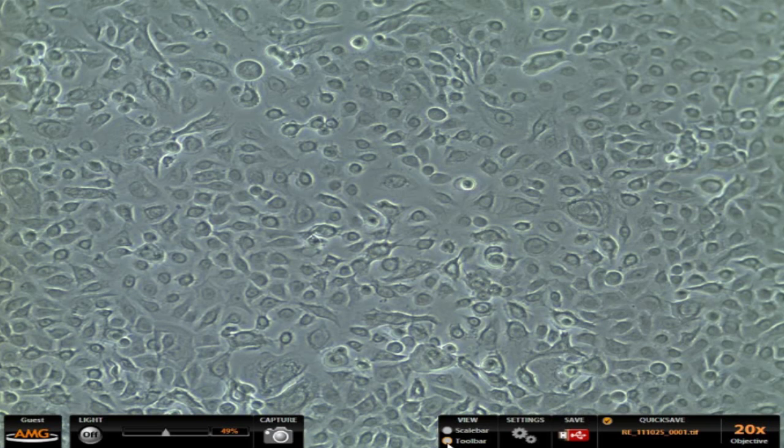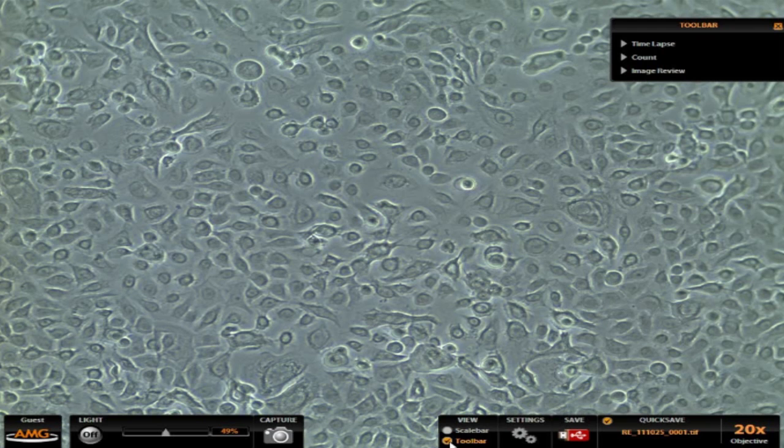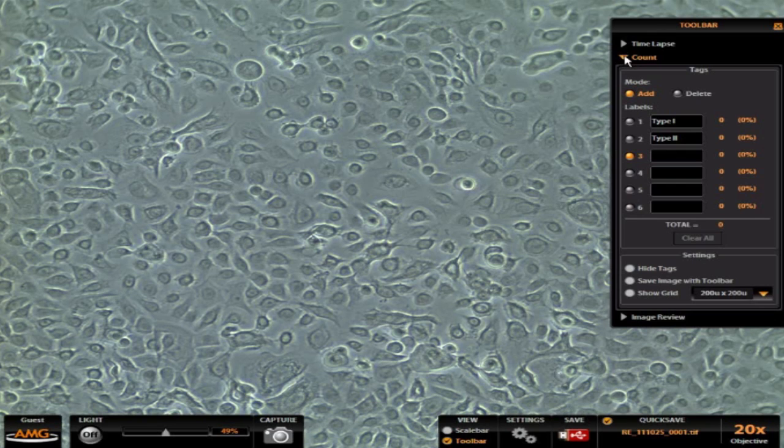To do that, I'm going to go over to the toolbar here. Turning on the toolbar opens up this little box and there's a count tool that I can expand. And inside that count tool, I've got up to six different categories that I can create and keep track of. And for this particular setting, I've got type 1 and type 2 cells predefined.